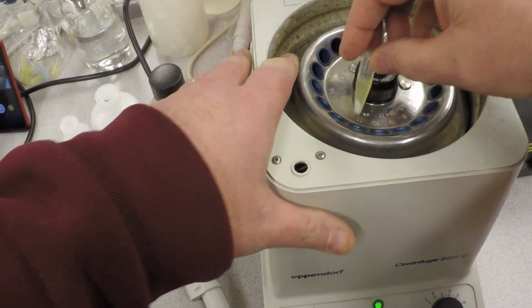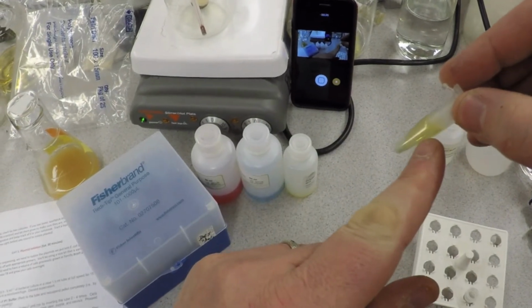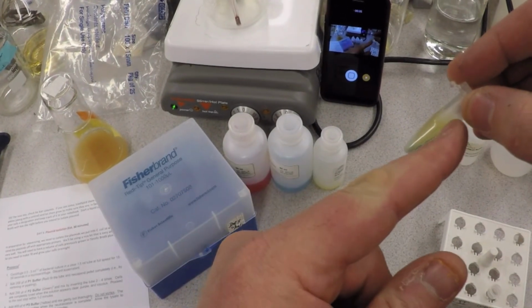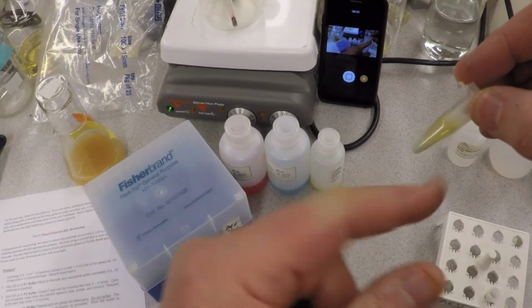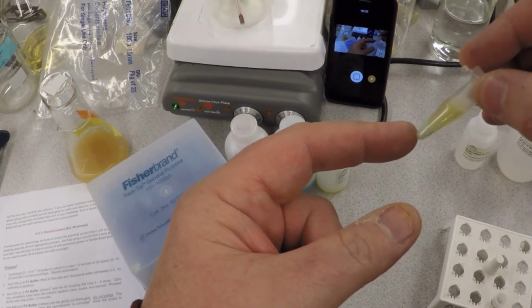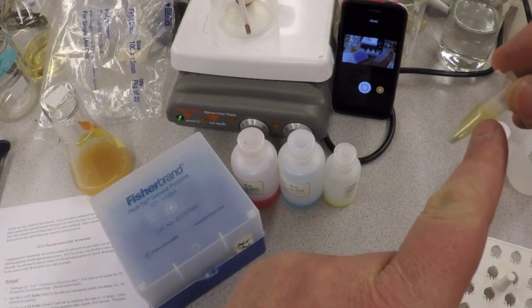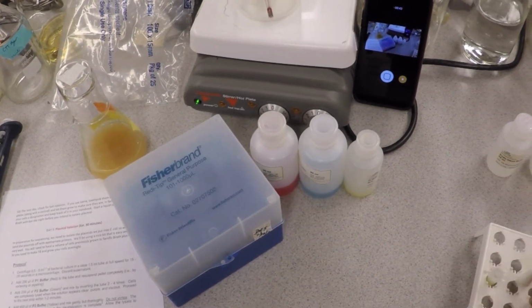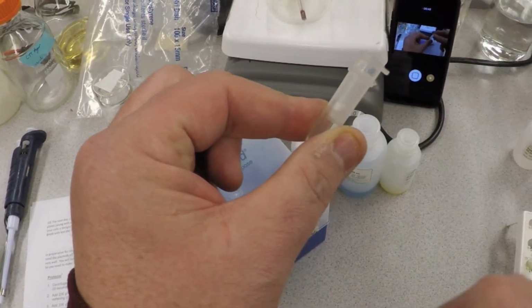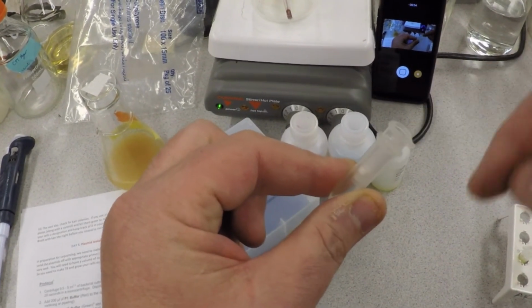Now when you pull this out, you'll notice that you've got a bunch of supernatant and that white flocculent pellet. Okay, the next step, you're going to take all this clear stuff which has our plasmid in it. This down here is all the nucleic acid other than the plasmid. It's fats, it's protein, it's all kinds of junk you don't want. So we're going to transfer this supernatant into our little column that we just assemble by grabbing this column piece and putting it in the collector. And all you're going to do is put the contents of that yellow stuff into this little column.